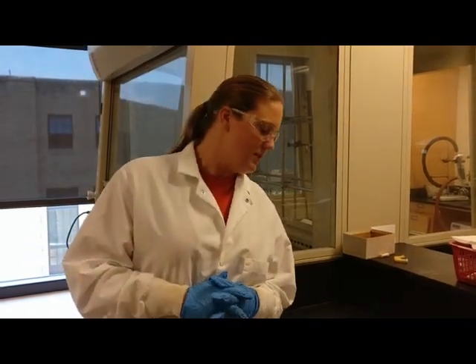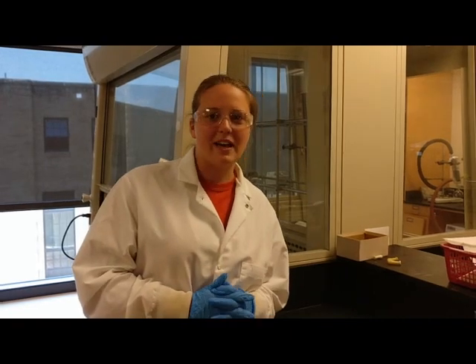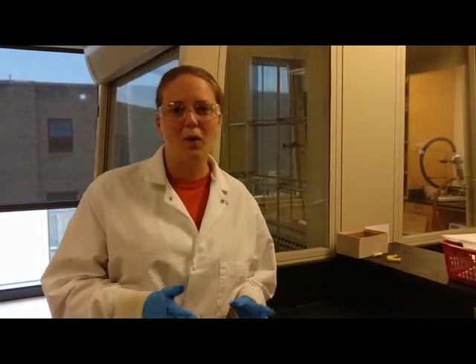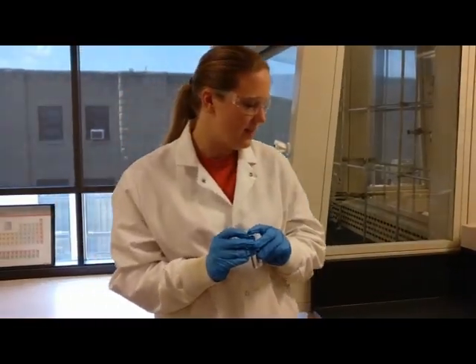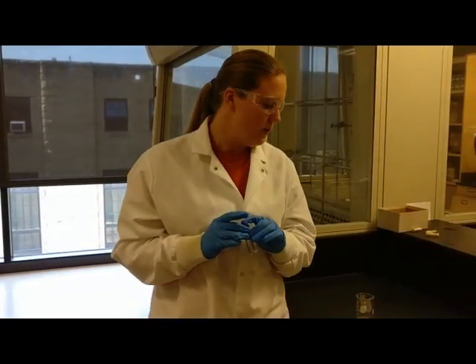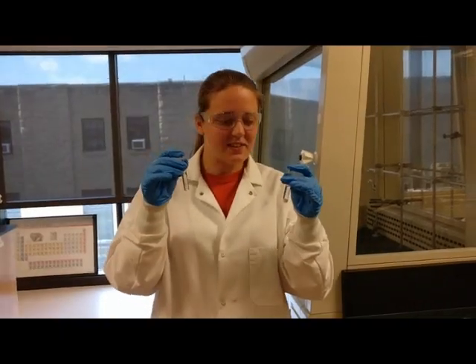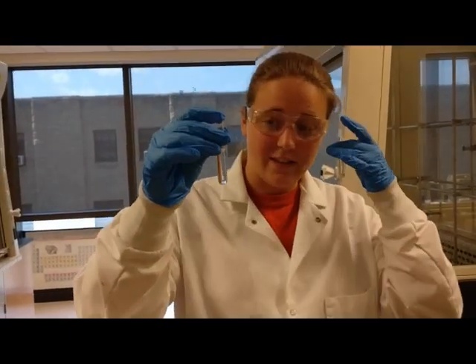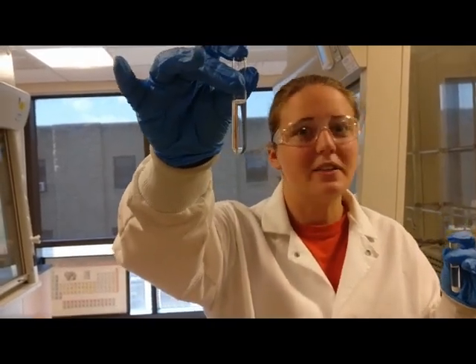And so we are going to talk about choosing the correct solvent for the recrystallization. So what we're going to do is we're going to explore three different scenarios that you may encounter. After you add your crude material in, you get to choose what solvent you want to dissolve it in. As you can see in the first one, the solid dissolved completely when you added the solvent. So this solvent is too good and we will not be able to use it further.